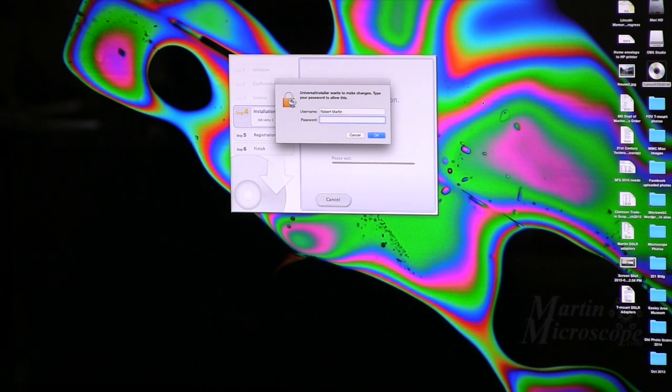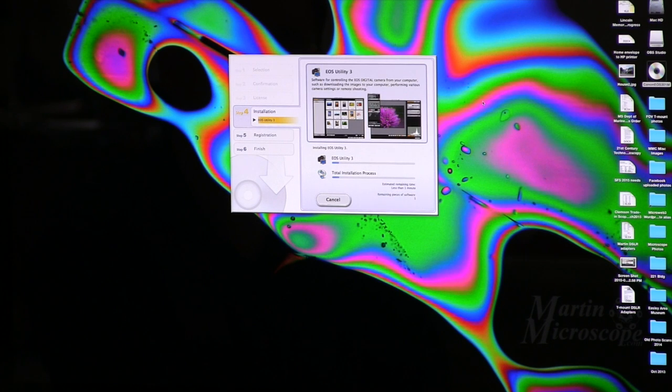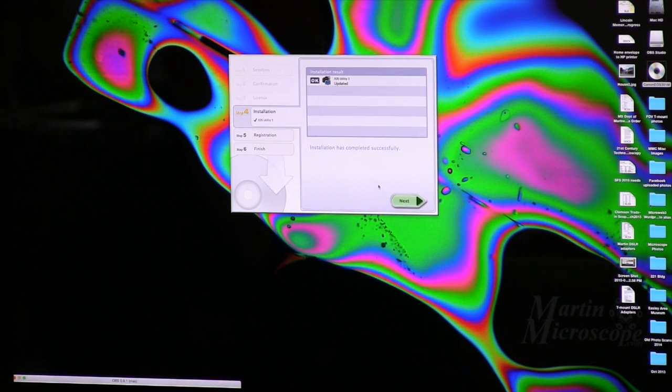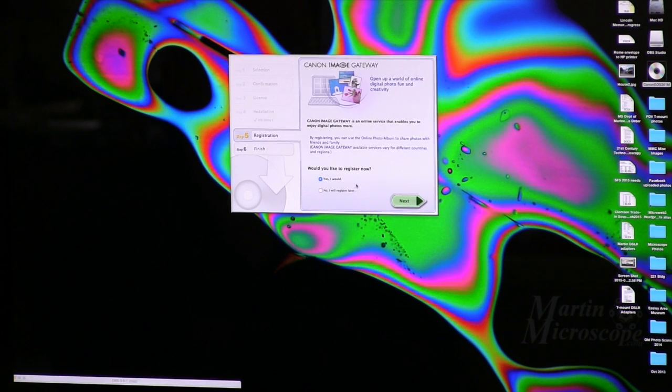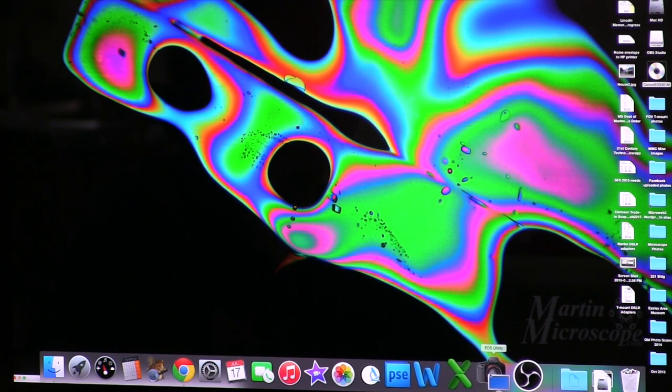I need a password to install it on this computer. Let's see if I'm already in the installation. It says EOS Utility 3, software for controlling the EOS digital camera from your computer. Would you like to register now? If you have a new camera and you're going to register, I'll say register later. Okay, and finish. So I think we're done with that. Down here in my software bar, I should have EOS Utility now.